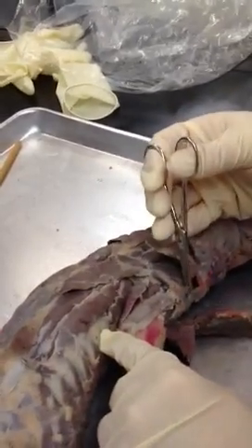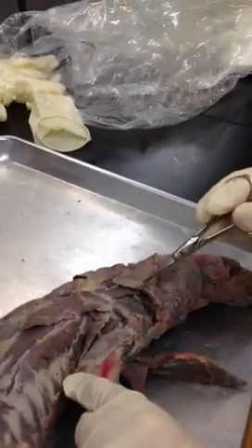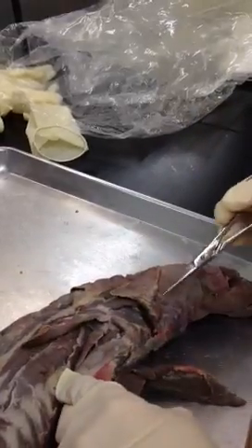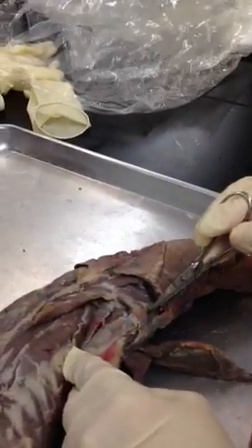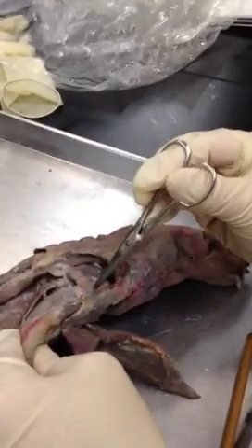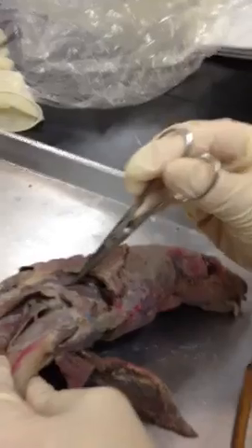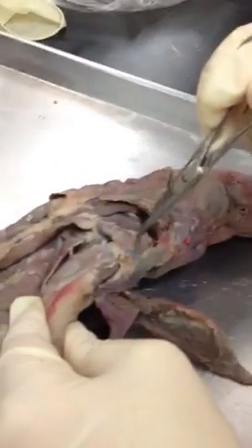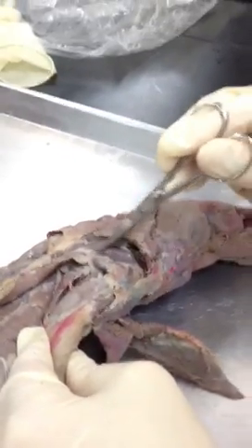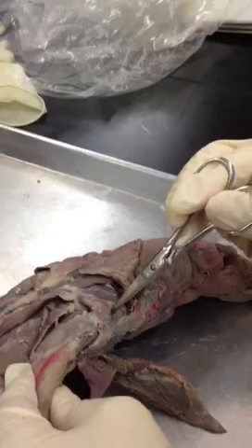Just for the 230 people — this was supraspinatus, infraspinatus. Right here is acromiodeltoid. Now we can see all three deltoid muscles: spinodeltoid, acromiodeltoid, clavodeltoid — all going around the shoulder. The big muscle on top here is supraspinatus. Here's the line that separates supraspinatus from acromiodeltoid, which shows up really nicely on this mink.